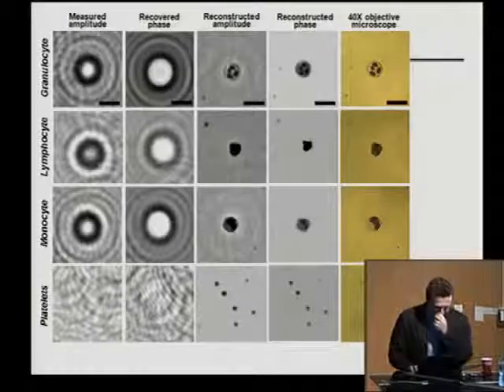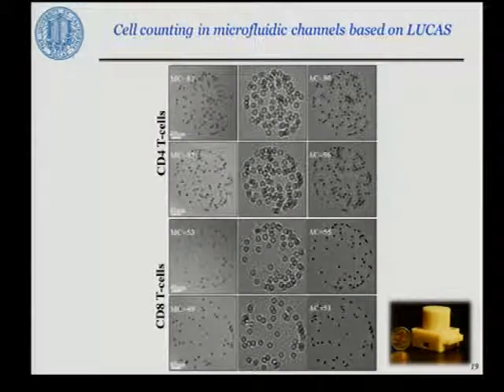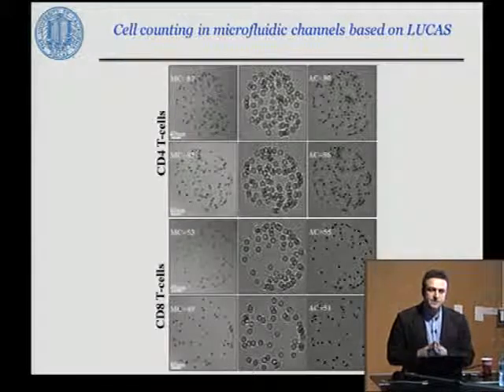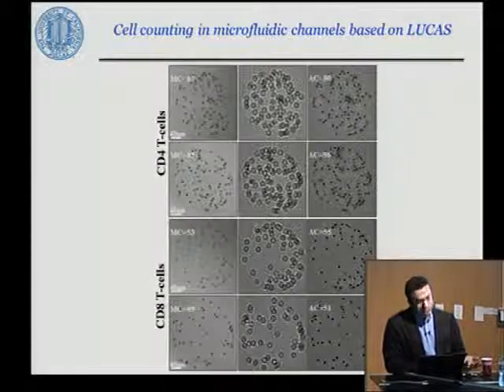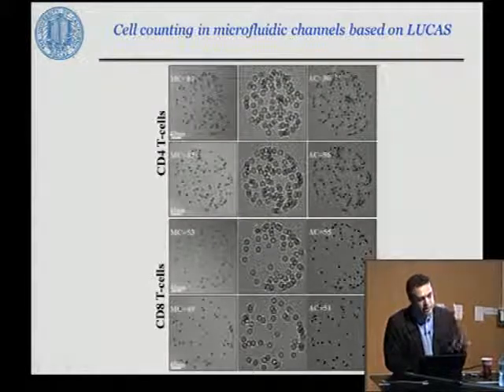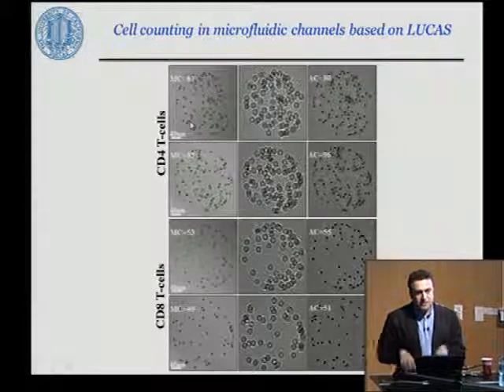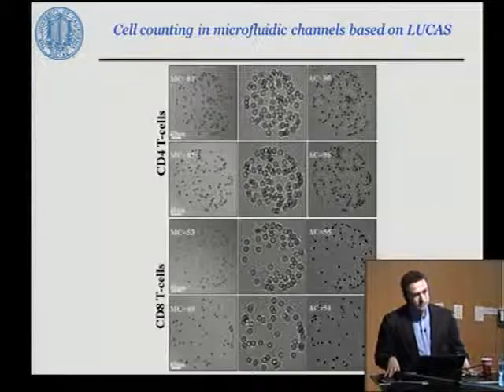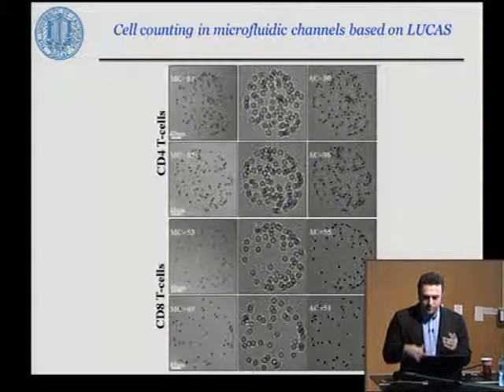images of the specimen. Even with the simple geometry, you can actually work this platform as a specific cytometer for even objects that are very difficult to differentiate under a light microscope unless it's labeled. You can actually do surface chemistry to capture different subpopulations of cells and start reconstructing them and counting them. In this example, we're focusing on lymphocytes, CD4 positive and CD8 positive lymphocytes, with the hope that for an HIV positive patient, we can monitor the depletion of CD4 lymphocytes with respect to CD8s.